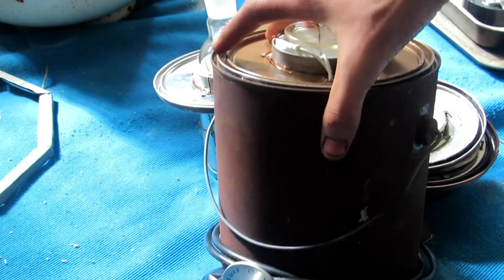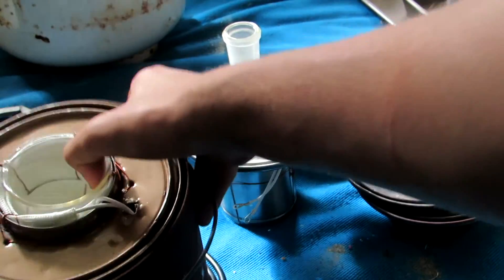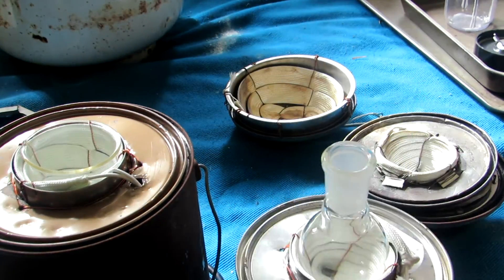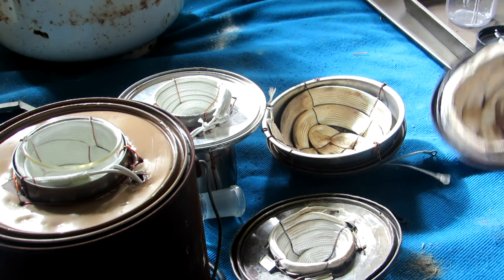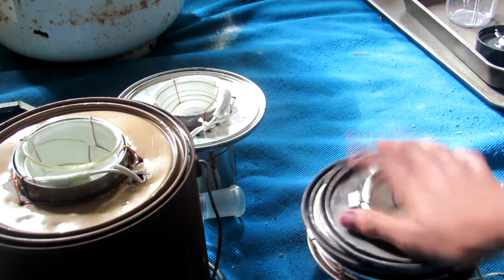As a side note, these insulated heating mantles should only be used near maximum power when the glassware contains something, as they can get hot enough to soften the borosilicate glass. Keep an eye out for future videos where we test these out. I hope you guys enjoyed, and I'll see you in a future project.